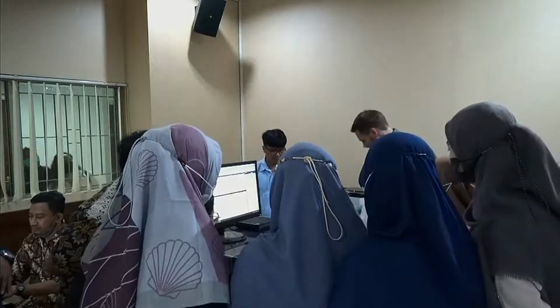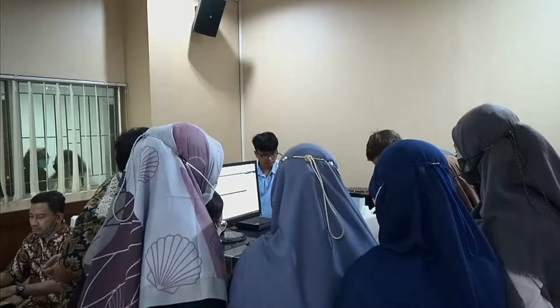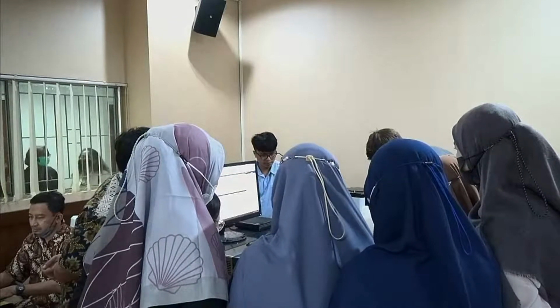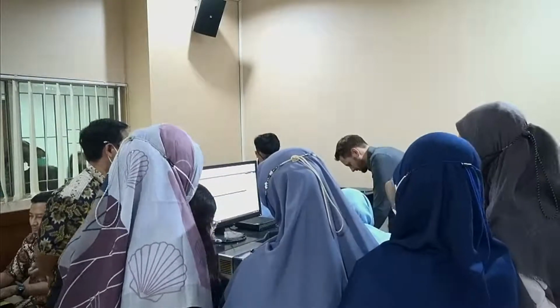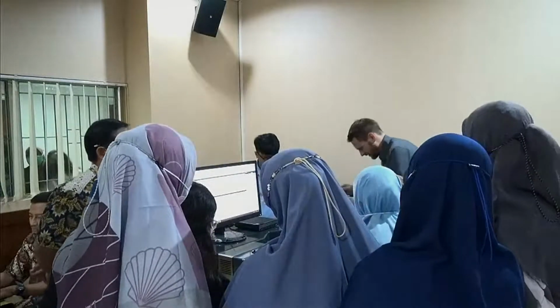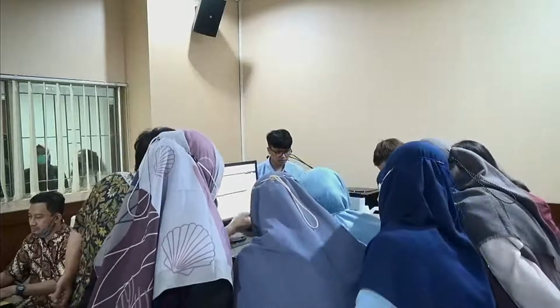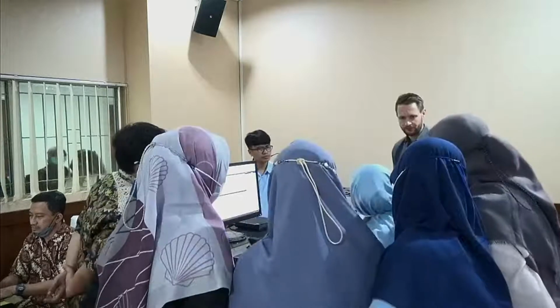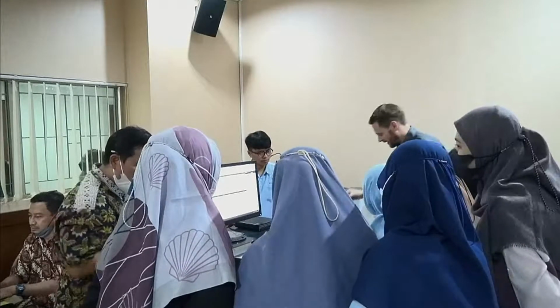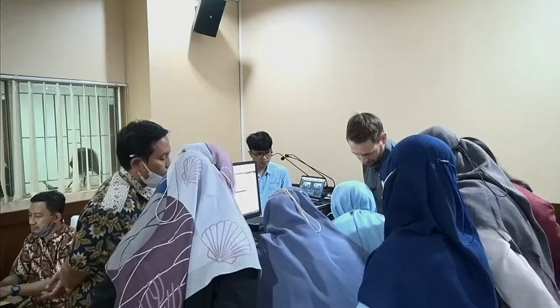So let's take some water here, put it in our beaker, and now add this carbon black. The reason we do this is we want to see how it behaves with water. Does it disperse? Of course I picked this carbon black for a reason, because you see it doesn't disperse at all. It's just staying on top of the water.